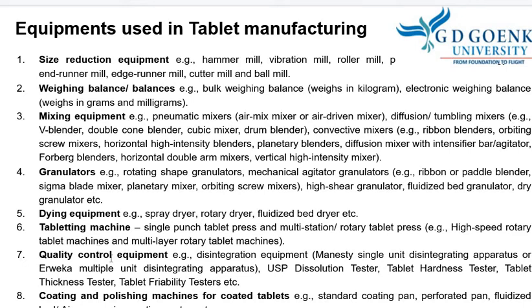The quality control department contains quality control equipments like disintegration apparatus, dissolution apparatus, hardness tester, thickness testing apparatus or instrument, for example, screw gauge or vernier calipers.